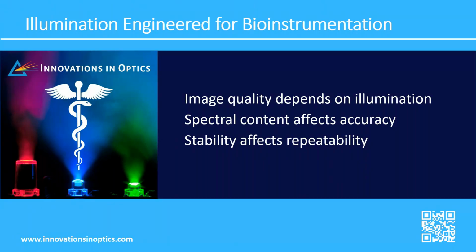As biomedical imaging continues to evolve toward more analytical and quantitative techniques, illumination increasingly becomes an engineered subsystem that directly influences overall performance. To see how these requirements emerge in practice, let's take a look at several biomedical and life science applications that rely on advanced illumination technologies.